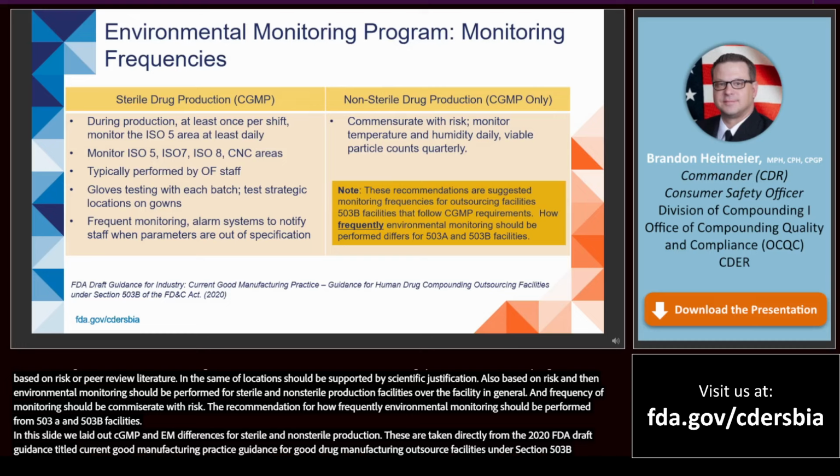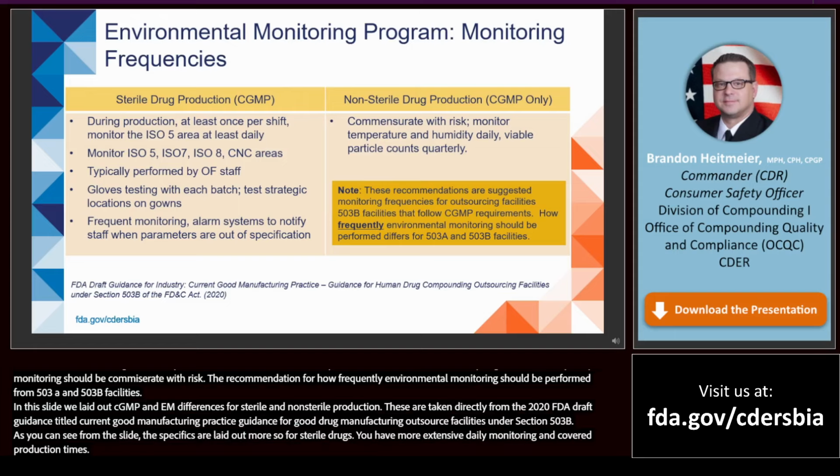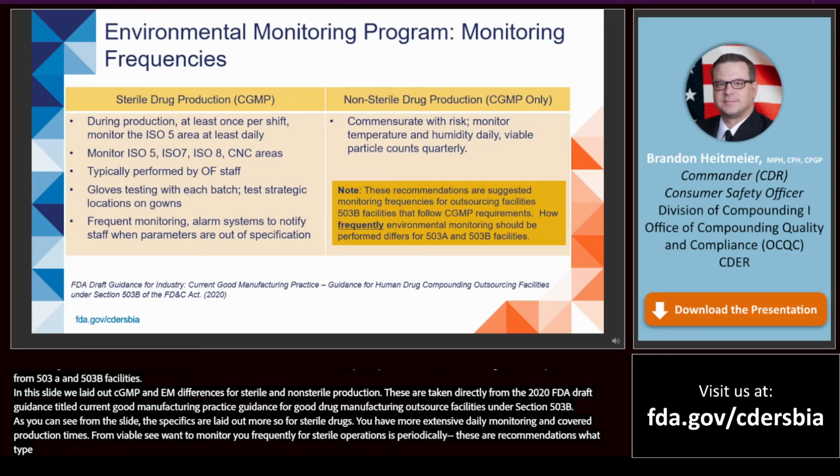As you can see from the slide, the specifics are laid out more so for sterile drugs, where we have more extensive daily monitoring and covering production times and shifts. For viables, you want to monitor very frequently for sterile operations, whereas periodically, such as quarterly, may be acceptable for non-sterile production. These are recommendations. What types of monitoring and what frequency an outsourcing facility needs is really dependent on the operations and the facility design.